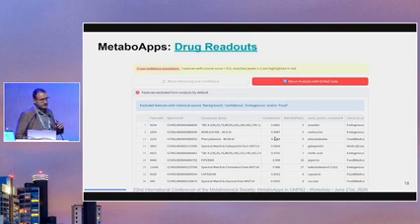And also keep in mind that in this case, for example, the example one, those features on this lower table that you can see just below the initial table, the annotation table, those are the excluded features. So keep in mind, especially for the ones that are directly working with exposomics or any type of exposure data, that some things that you might not see on your annotation table are based on the default exclusion list. So always keep in mind that some compounds that you may be expecting to see in all of your samples are just being excluded because those are the default for the app. So always make sure of that.